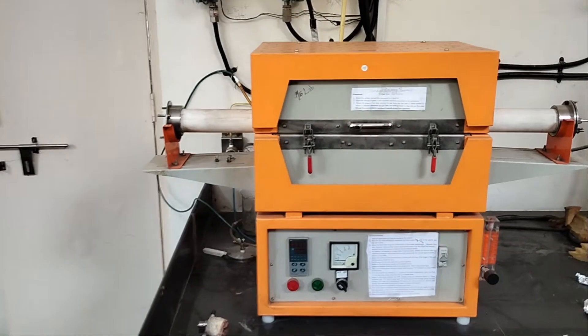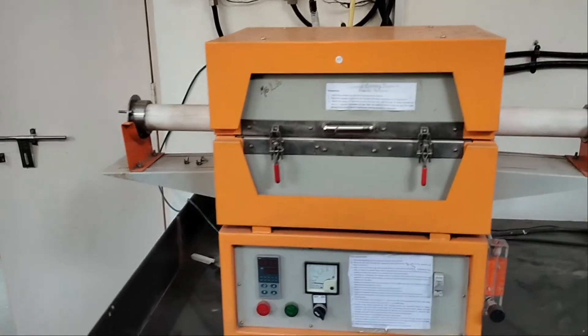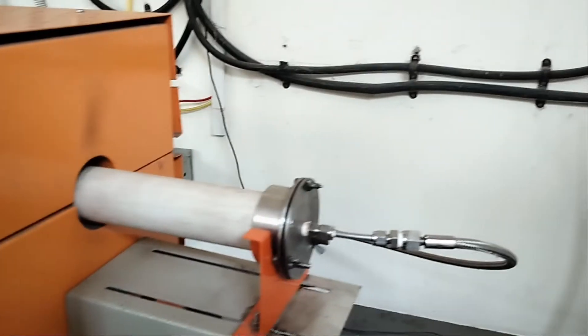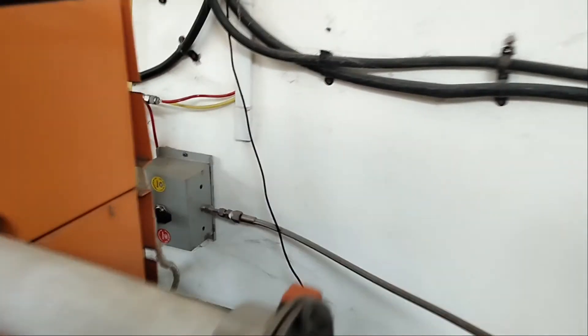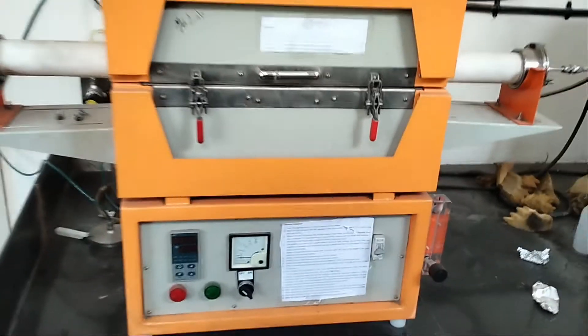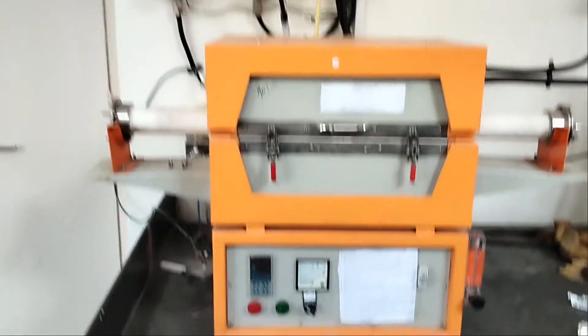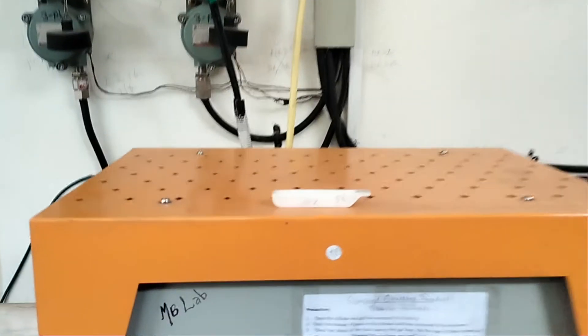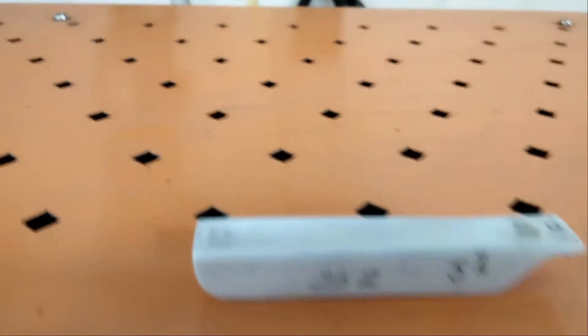This is a tube furnace which can go up to 1200 degrees Celsius. It is a long tube kept inside an oven. We will take the sample in an alumina board, and this is the alumina board.